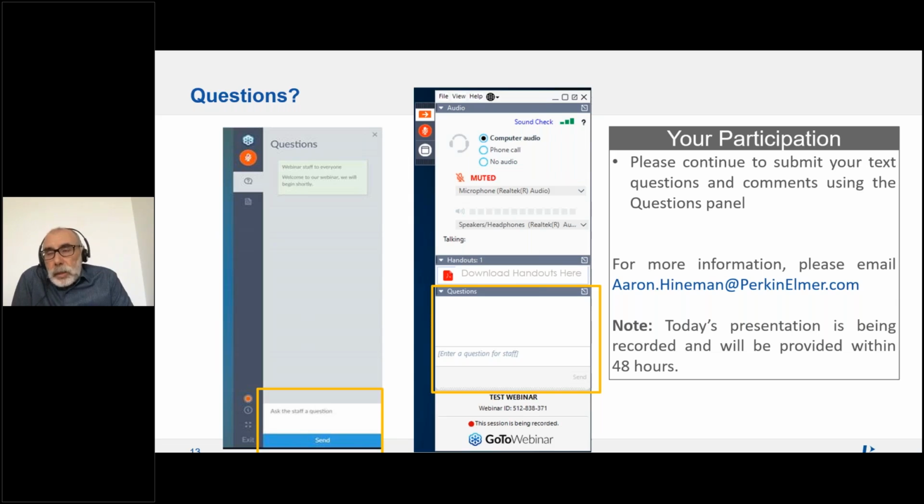This is one of the, well, we have been talking about, let's say, the standard limitations, but of course, the sample matrix with a high carbon content is going to affect the size detection limits, but in these cases, the only solution is to implement some kind of previous treatment. The typical example, as I already mentioned, is a natural water with a high carbonate content, for instance.